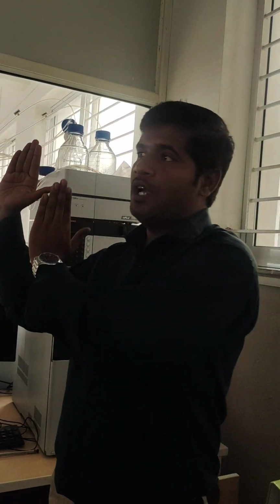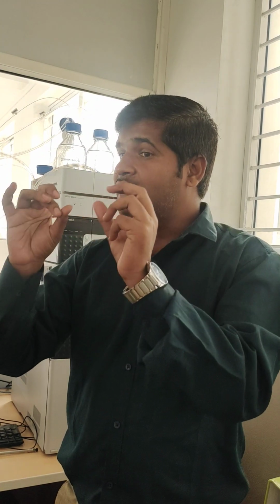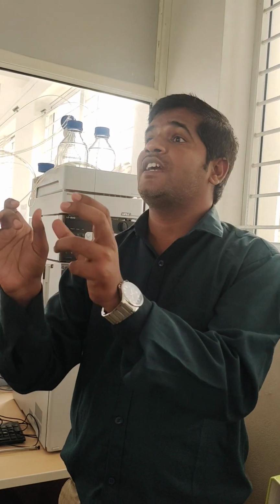We scan the sample between 190 nanometer and 800 nanometer, and check the area of the sample at 10 different wavelengths. How many wavelengths can we check? 10 different wavelengths. That's why we call it a multiple wavelength detector. The multiple wavelength detector is also called VWD. What is that? VWD. VWD means variable wavelength detector.